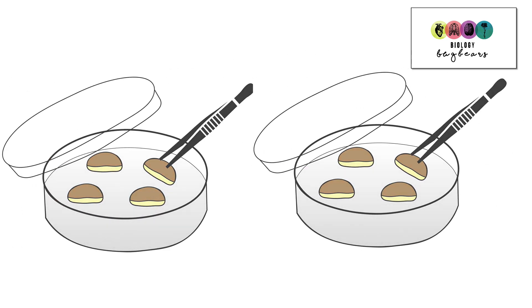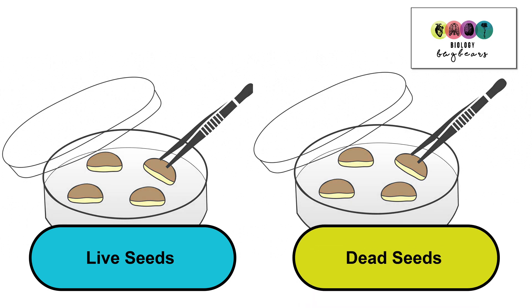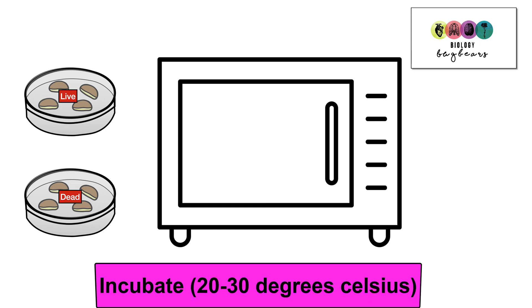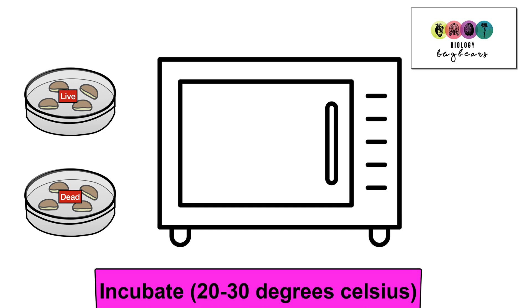Using aseptic technique, you're going to position your seed halves with the cut face onto the starch agar and very quickly close up the agar dish. You will have one petri dish with the live seed halves and another petri dish with the boiled, dead seeds. With the lids firmly secured, place them into an incubator. Remember also to label your dishes 'live' and 'dead' — it's very important that you can tell the difference. Set the incubator at anything between 20 and 30 degrees Celsius and leave them for a few days.